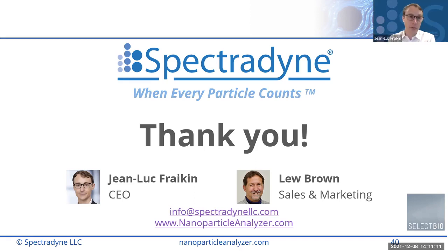Maybe one last question here from Gitika Raizada. What happens when the size range of our sample is very large? So as we mentioned earlier, it takes multiple measurements to measure that full size range, right? On cartridges that have different aperture sizes. But most people in typical usage end up focusing on one cartridge size that gets them the information that they need. So it's not like every time you walk up to the instrument, you have to do multiple measurements. Usually you focus in on a useful range for what you're working on.